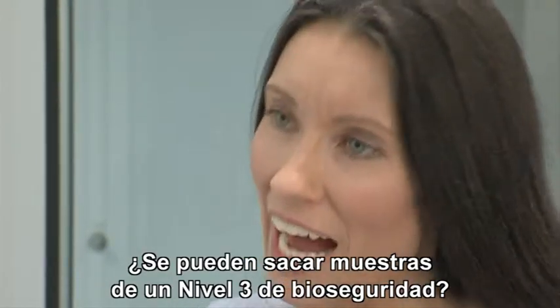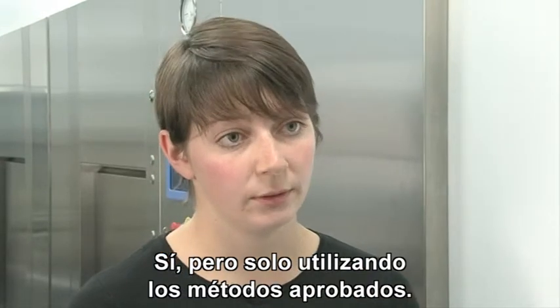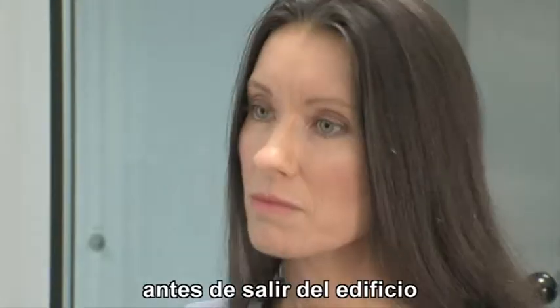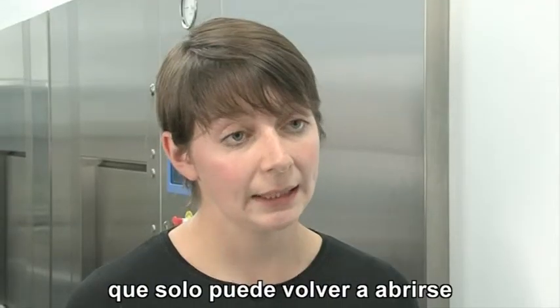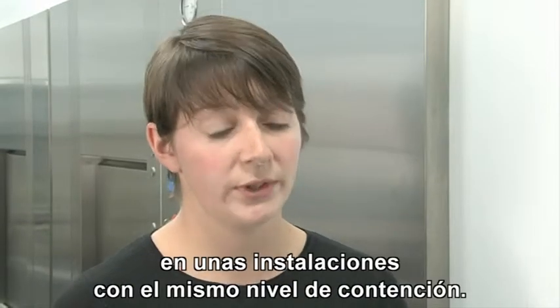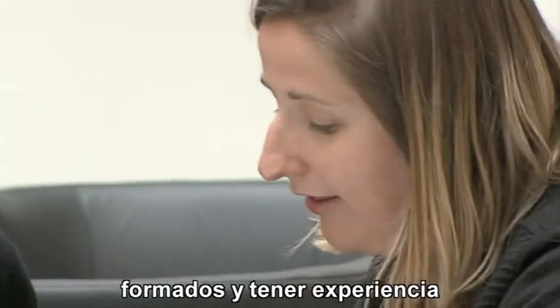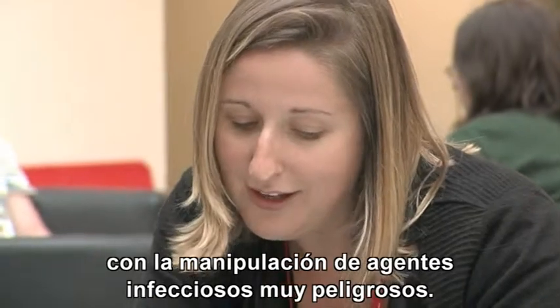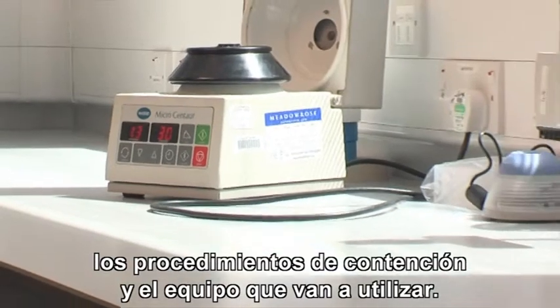Can samples be taken out of biosafety level 3? Yes, they can, but only by using an approved method. For example, material must be inactivated by a validated method before exiting the building. Or material can be surface decontaminated, and they can only be reopened in a facility with the same level of containment. At levels 3 and 4, laboratory scientists must be qualified, trained and experienced in the handling of extremely hazardous infectious agents. They must have a thorough understanding of the containment procedures and the equipment they will be using.